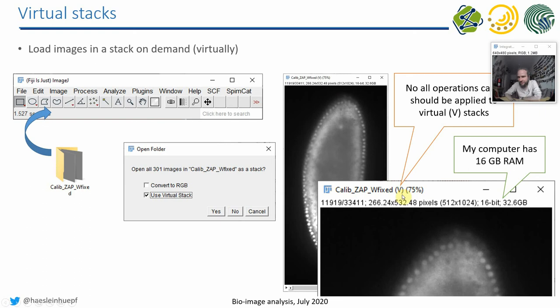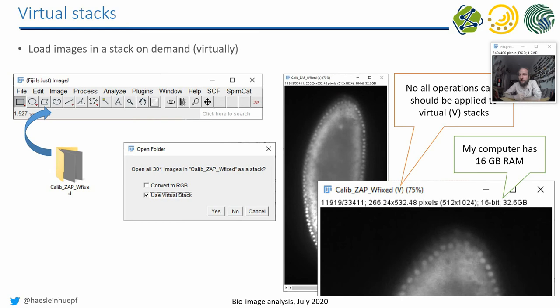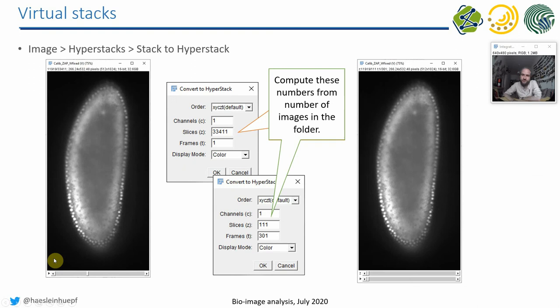It's quite important because you cannot do all the operations you want with virtual stacks. If you want to do maximum projections of all the time points, you have to actually open all the time points. If the virtual stack is three terabytes large, these maximum projections will take a week. So be careful depending on which operation you are doing.